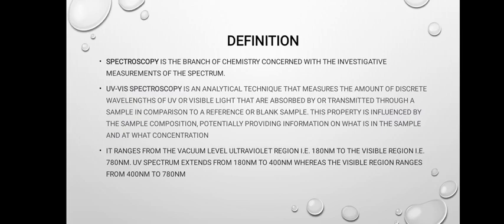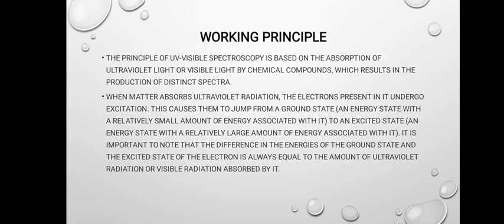The UV spectrum extends from 180 nanometer to 400 nanometer, whereas the visible region ranges from 400 nanometer to 780 nanometer. Now we will move to the next slide, that is working principle.